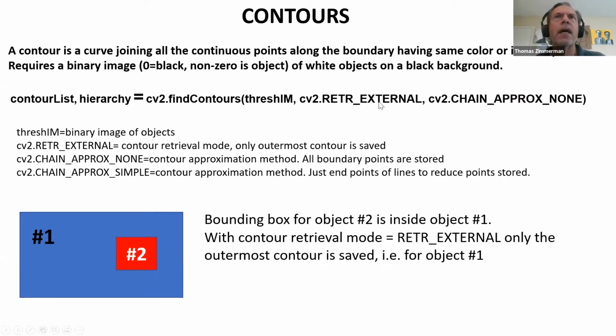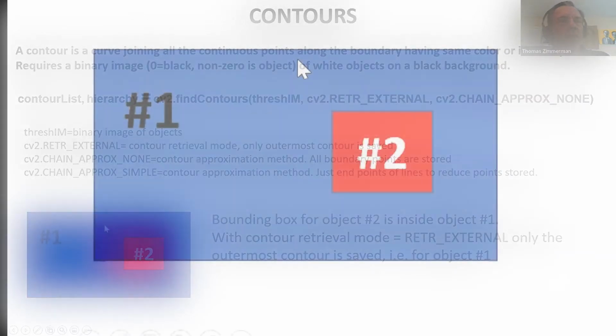And so we've got to talk about hierarchy for a second. So if you have, especially if you didn't do the blurring, and it has two outlines, remember, like we talked about holes, if we had a stentor, a cell, and then inside the nucleus had a different contrast, different intensity, and it thresholded to be another object inside, you'd have an object inside of an object.